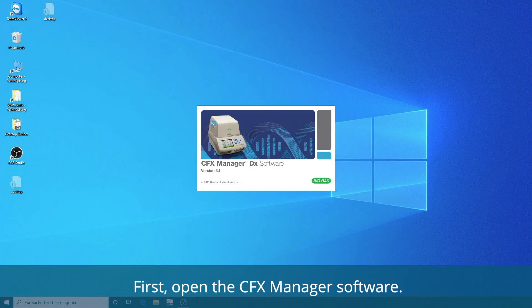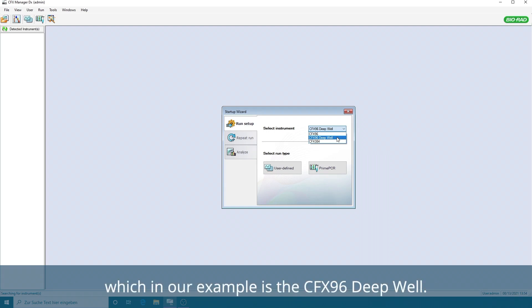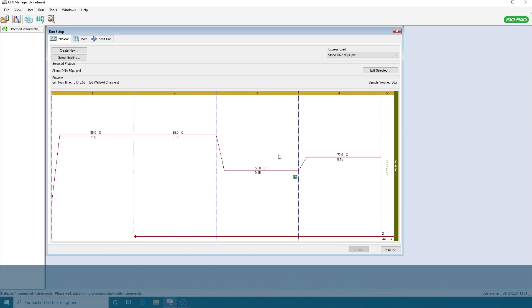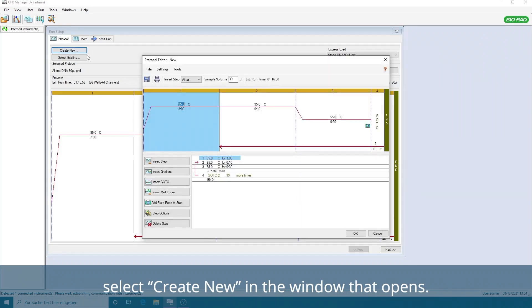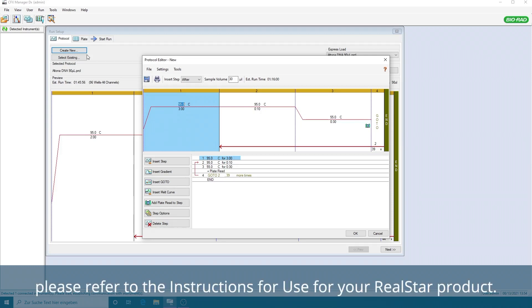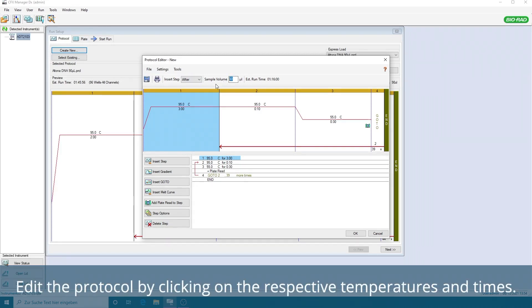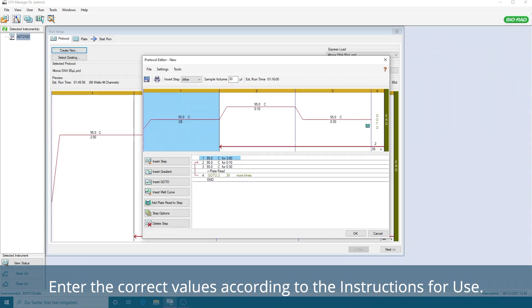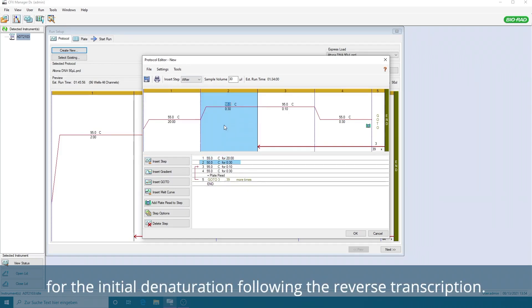First, open the CFX Manager software. In the new window, select the instrument you are using, which in our example is the CFX-96 Deep Well. Then select User Defined Run Type. To program the temperature profile on your cycler for the first time, select Create New in the window that opens. To select the correct temperature profile, please refer to the instructions for use for your RealSTAR product. Enter the sample volume of 30 uL. Edit the protocol by clicking on the respective temperatures and times. Enter the correct values according to the instructions for use. Select Insert Step After and Insert Step for the initial denaturation following the reverse transcription.